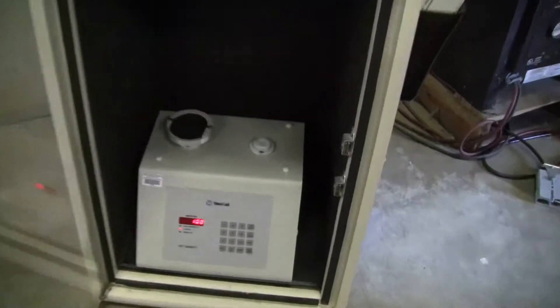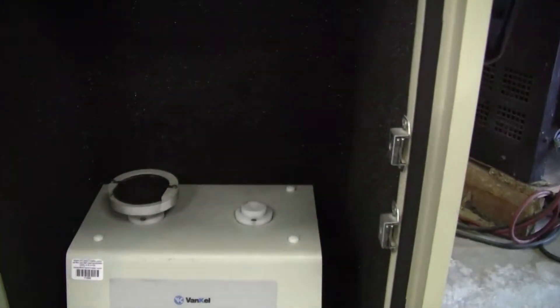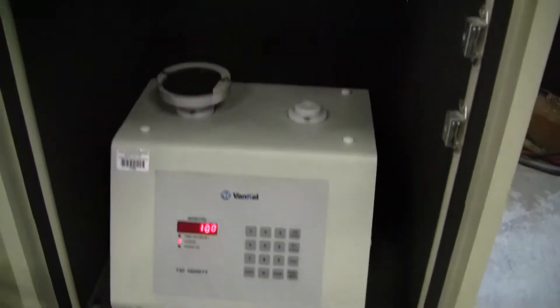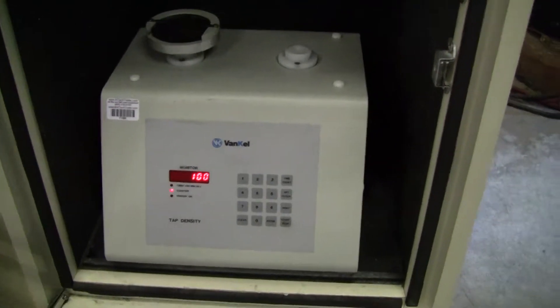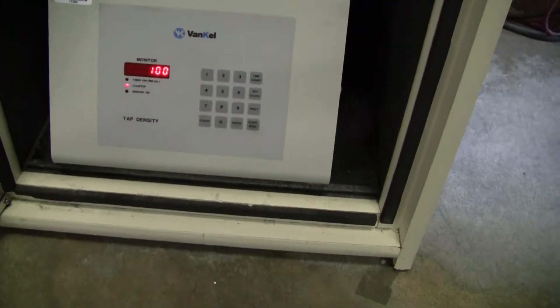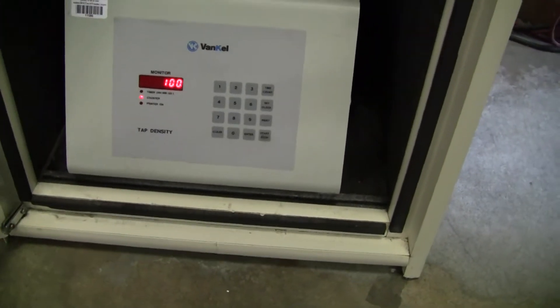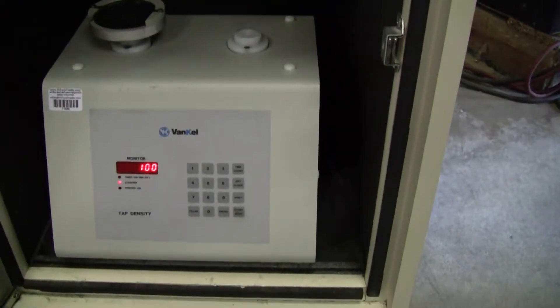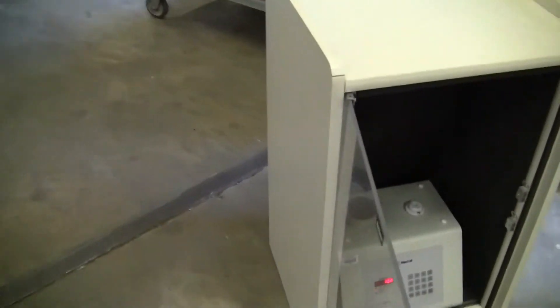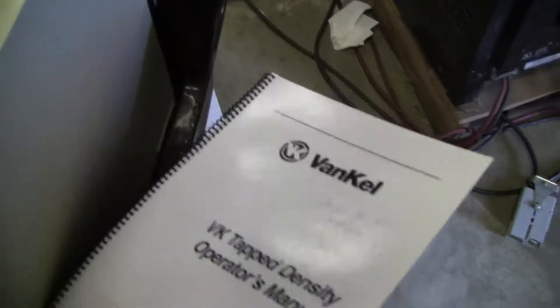You can see it's got dual platforms, but we only have one platform, as you can see. It is a LED control panel. You can do it by counter or time, 115 volts. It comes with the acoustic cabinet, as you can see. A handy pouch here on the side, comes with the operator manual.